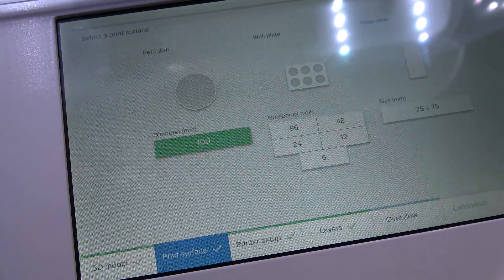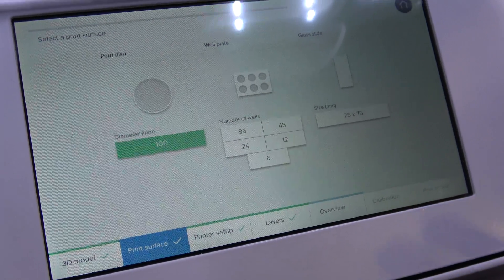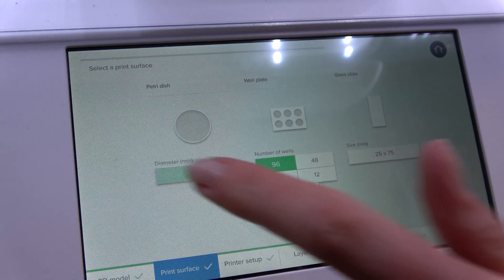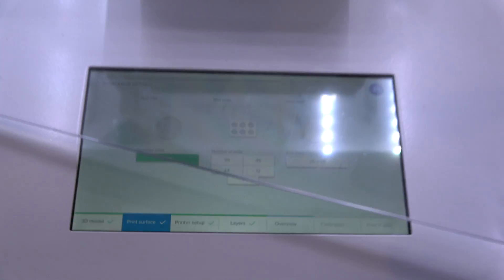Then you move forward to the print surface and you can either choose to print in a regular Petri dish or, for example, a 96-well plate. In this case, we're going to print with a Petri dish — just this one here.